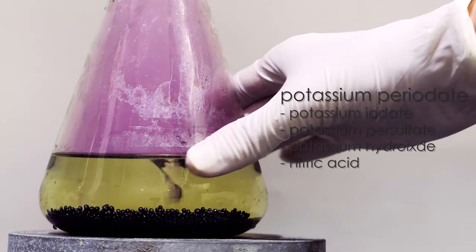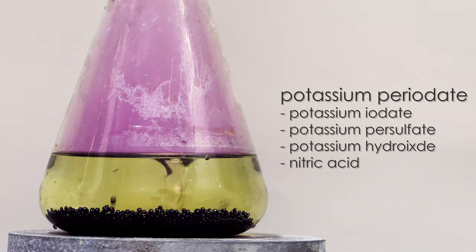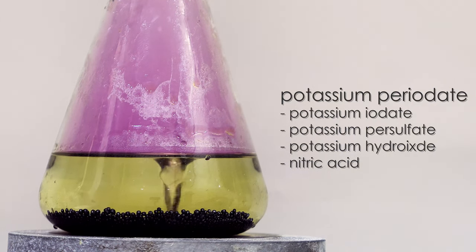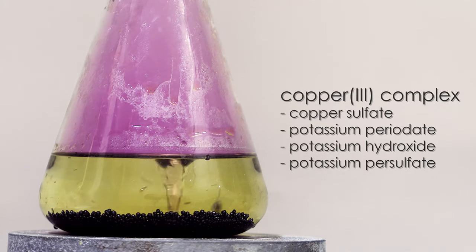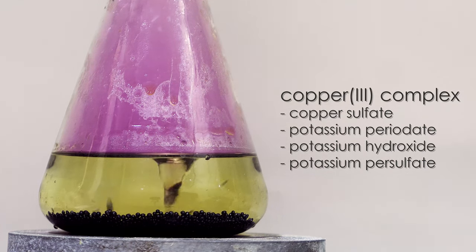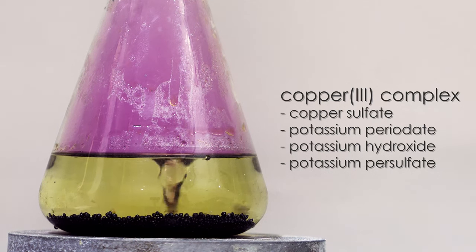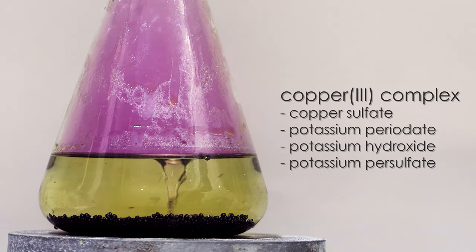Then for periodate, we have potassium iodate, which is made from the last step, potassium hydroxide, and potassium persulfate. Then for the final copper(III) complex, there are potassium periodate, potassium hydroxide, potassium persulfate, and copper sulfate pentahydrate.